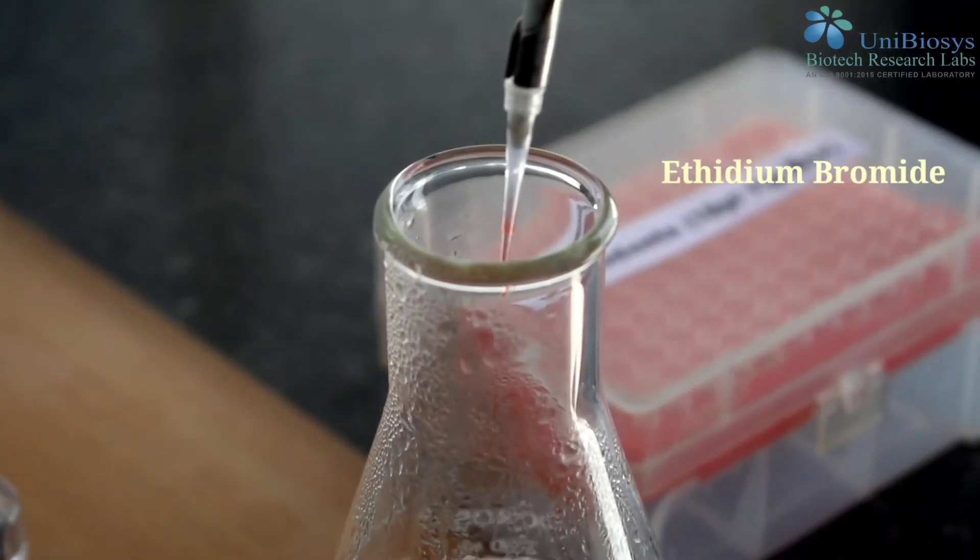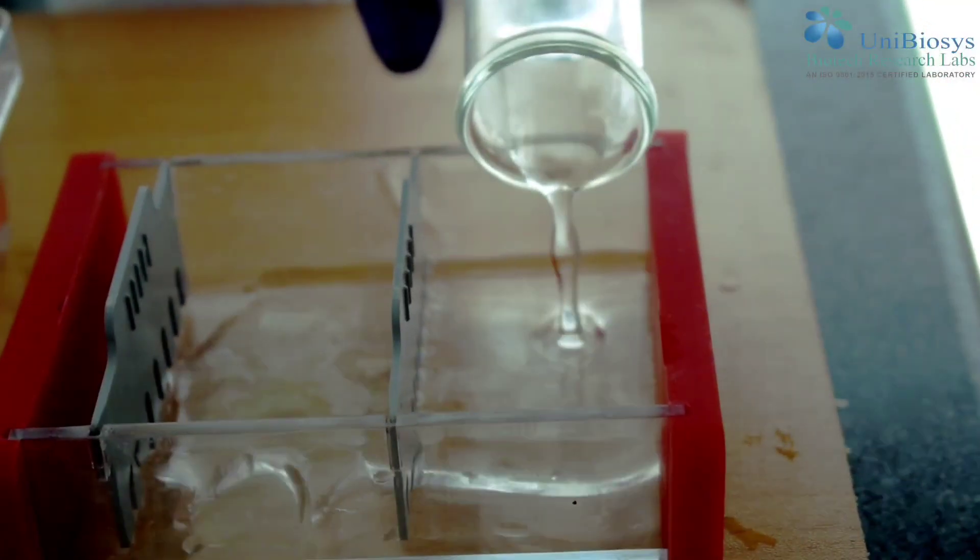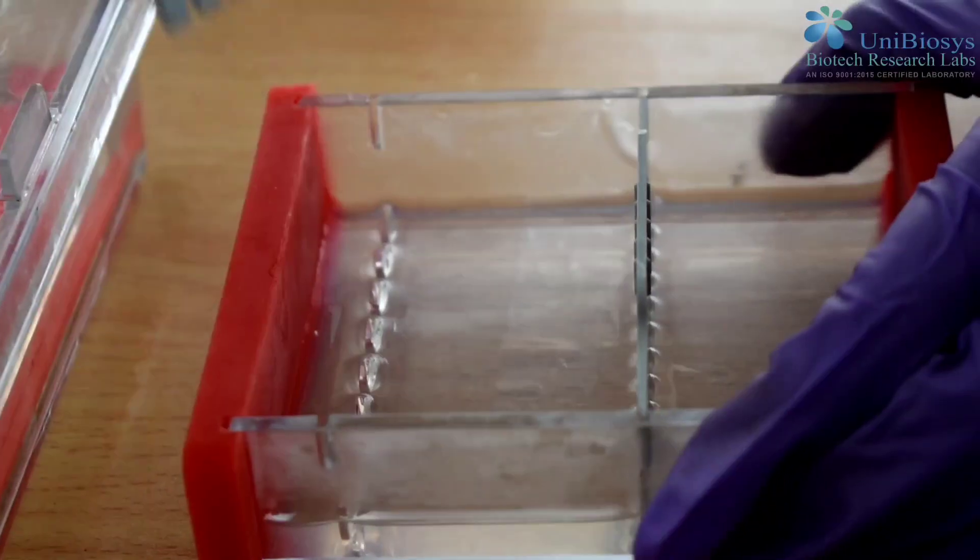After boiling and cooling, agarose is mixed with ETBR and poured into the casting tray. Once solidified, the gel is used for electrophoresis.